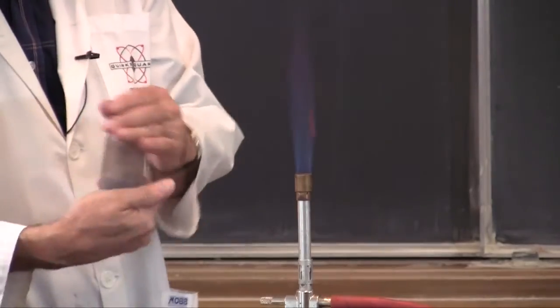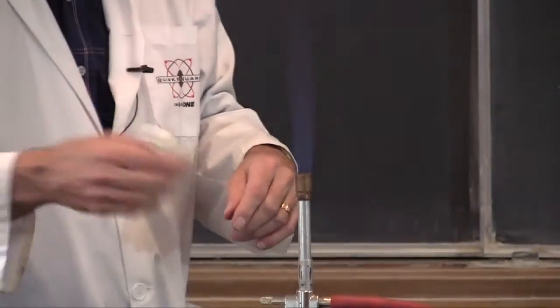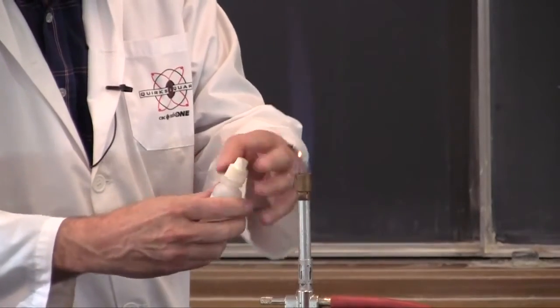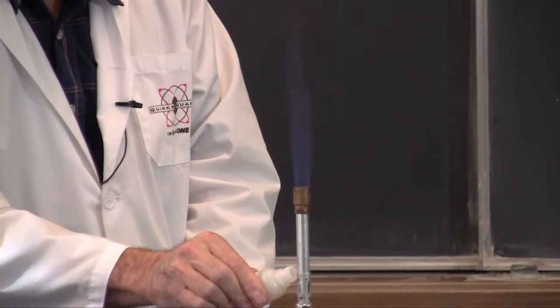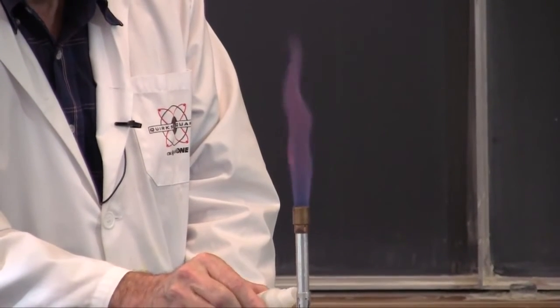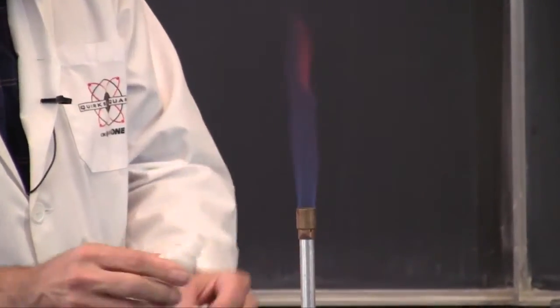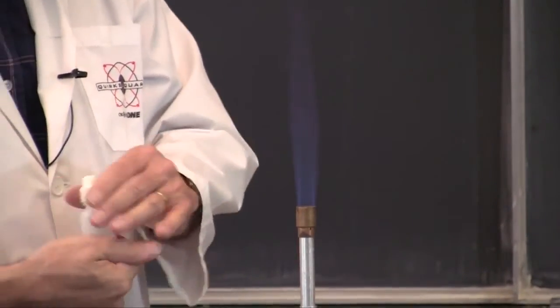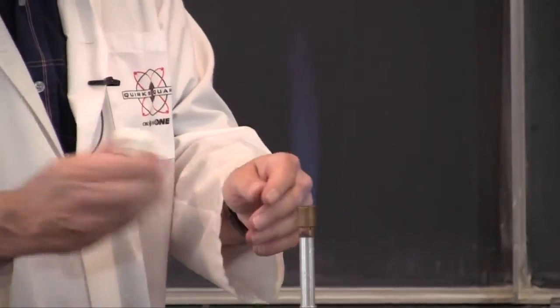All right, the potassium. And finally, lithium carbonate.